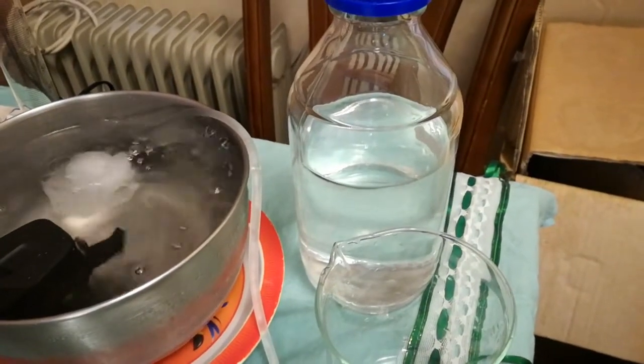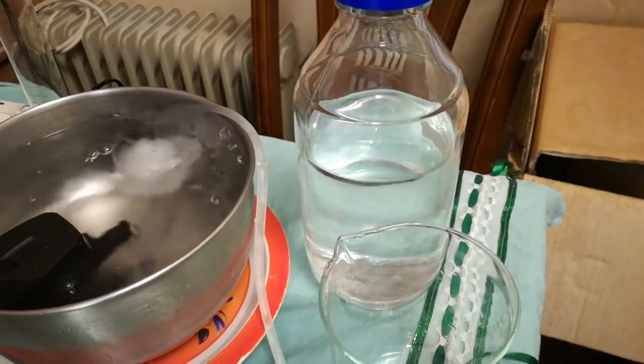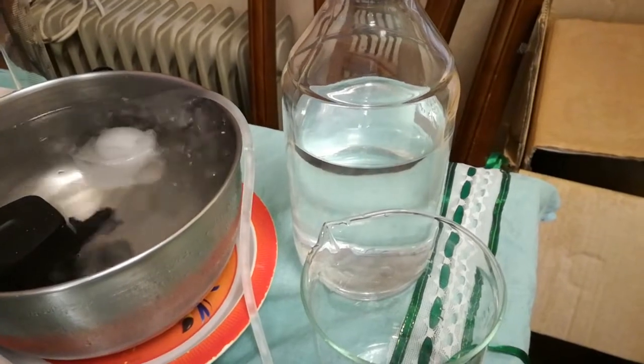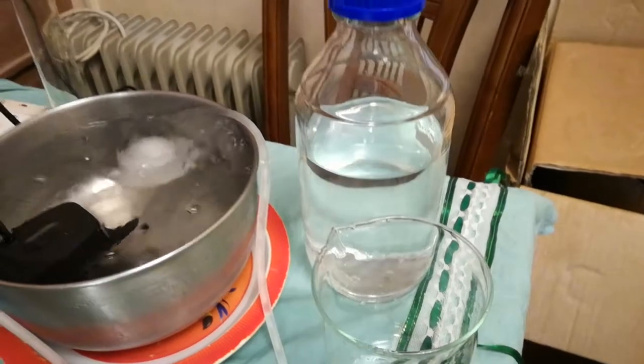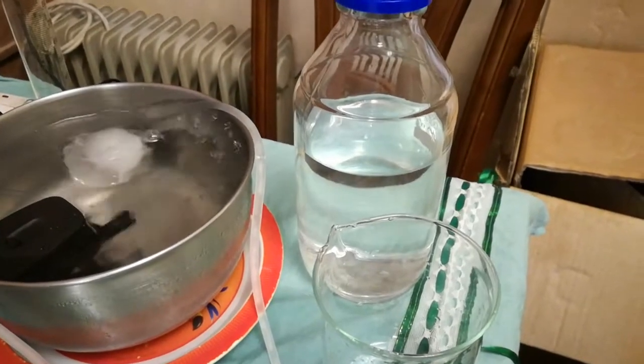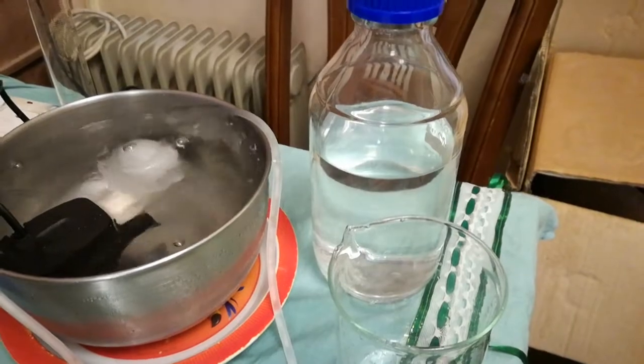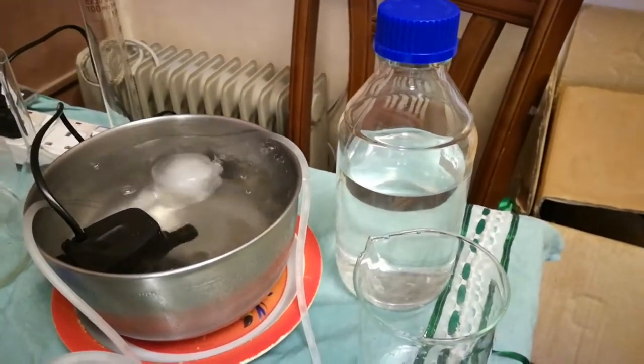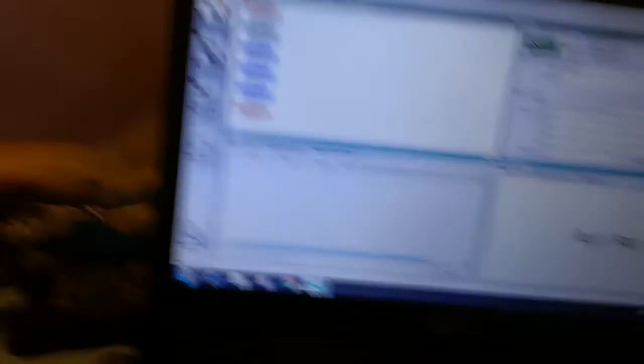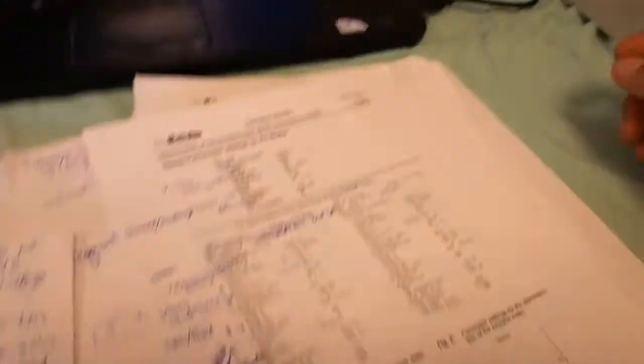First of all, we're going to prepare the reagent, which is a bromide-bromate solution, and the solvent mixture which is composed of glacial acetic acid, carbon tetrachloride, and methanol with sulfuric acid. Once we set up the methods as per the bulletin.